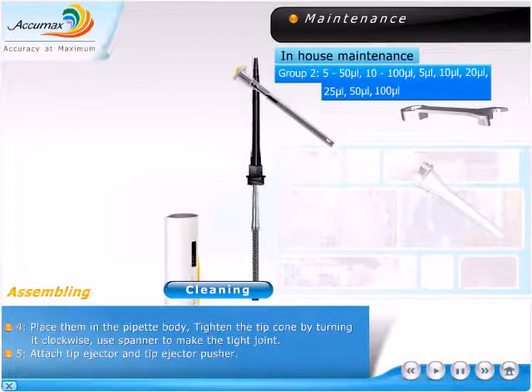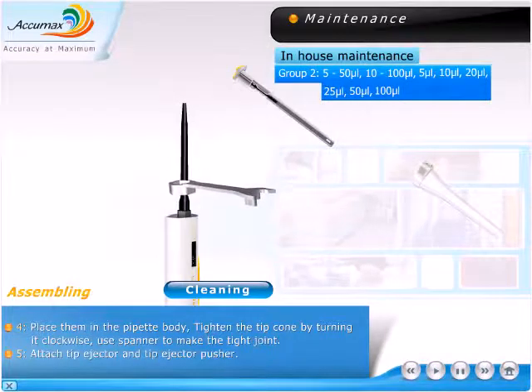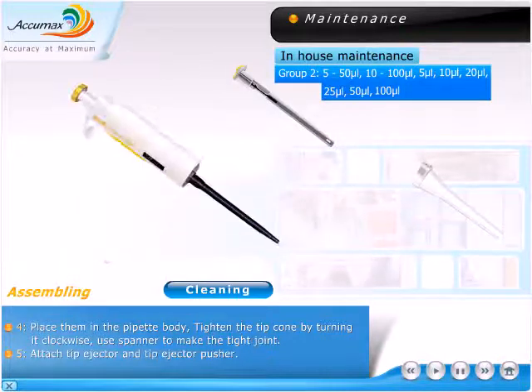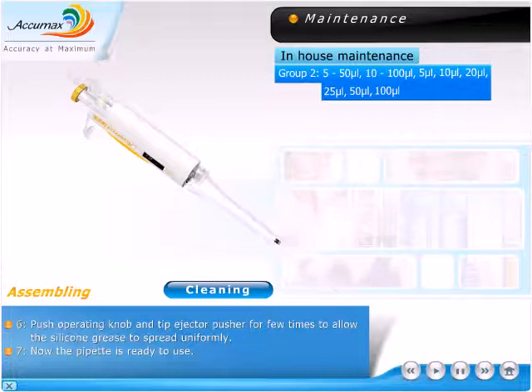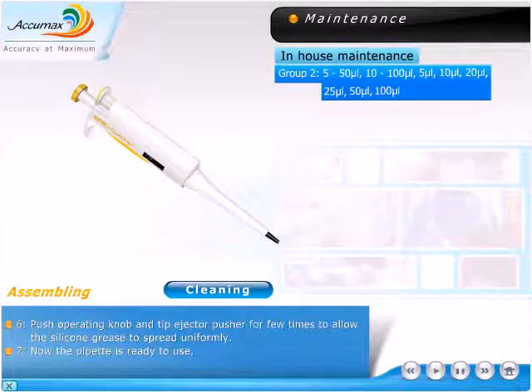Place them in the pipette body, tighten the tip cone by turning it clockwise, use the spanner to make a tight joint. Attach the tip ejector and tip ejector pusher. Push the operating knob and tip ejector pusher a few times to allow the silicone grease to spread uniformly. Now the pipette is ready to use.